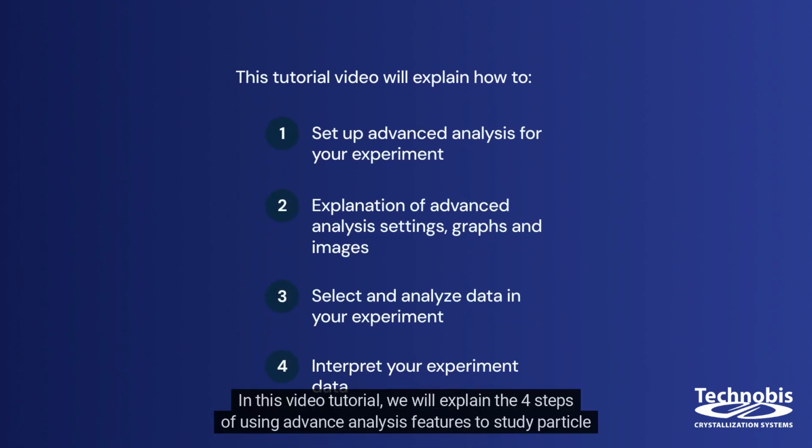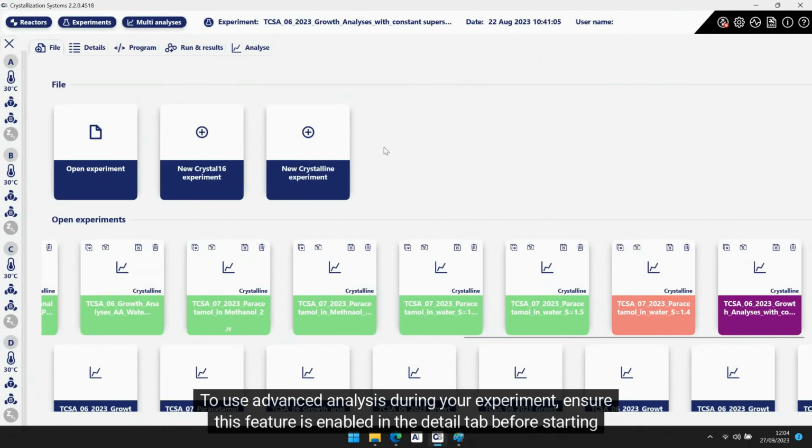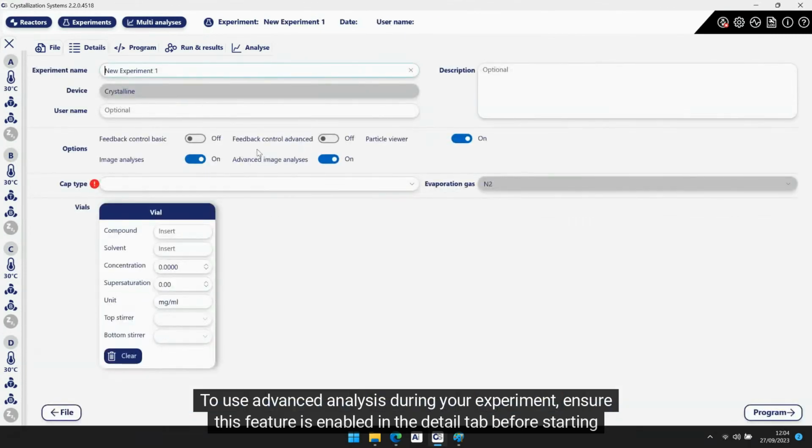In this video tutorial, we will explain the 4 steps of using advanced analysis features to study particle size distribution in the Crystalline instrument. To use advanced analysis during your experiment, ensure this feature is enabled in the Detail tab before starting the experiment.